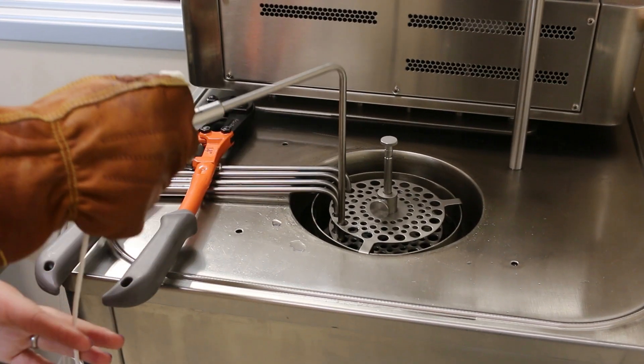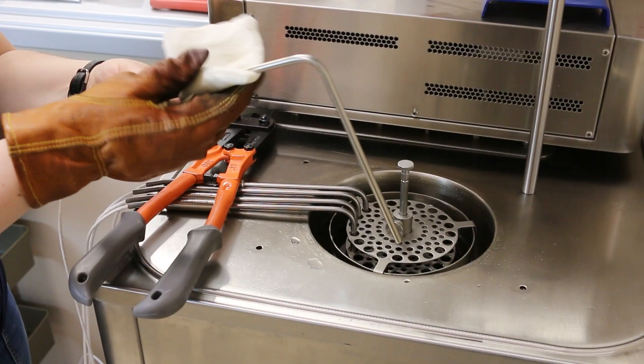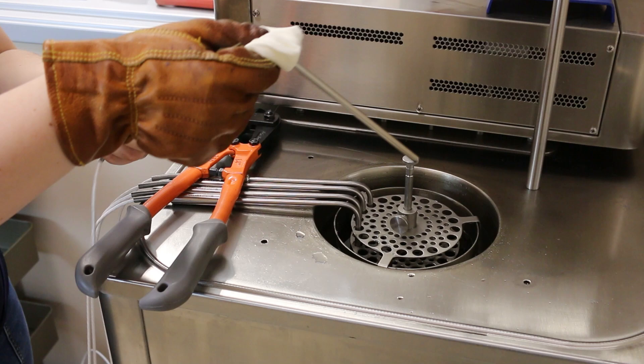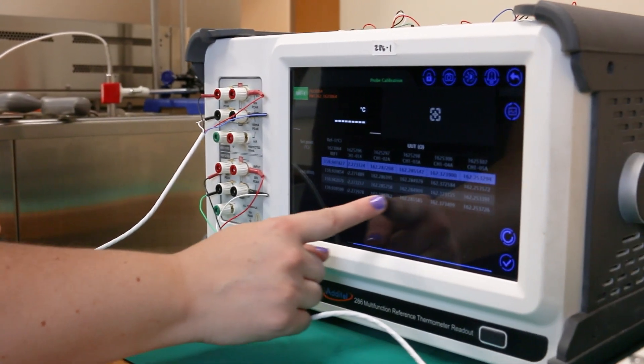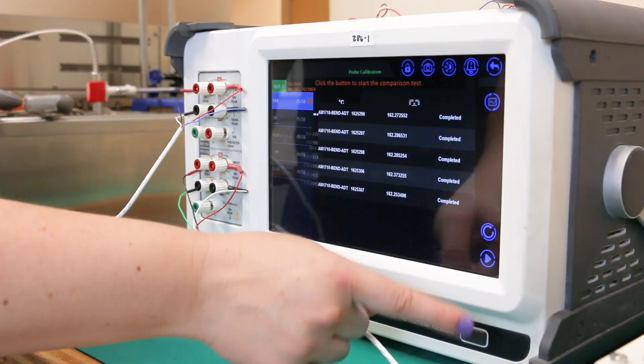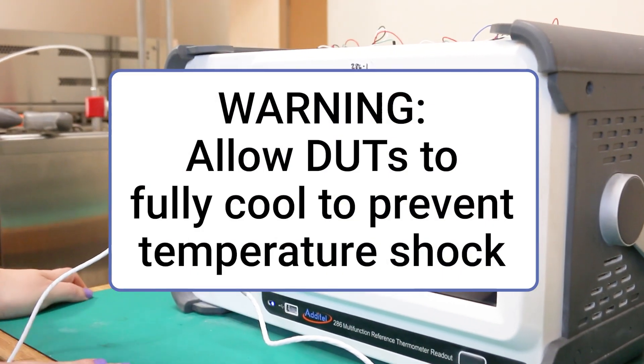After the test has completed, remove and dry off the probes, and store them where they can cool back down to room temperature. Since the next calibration point is the triple point of water with a much lower temperature than the 160 degree bath, it's important to allow the probes to fully cool before beginning new measurements.